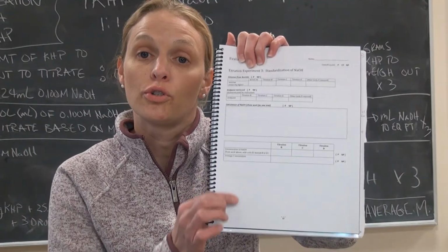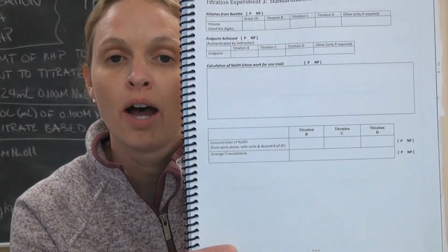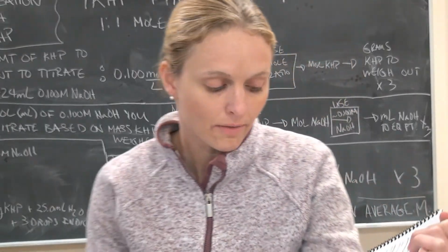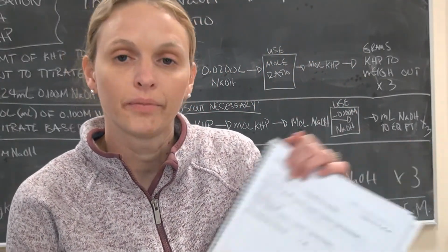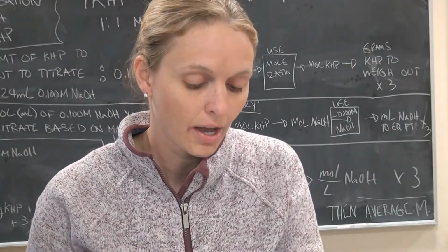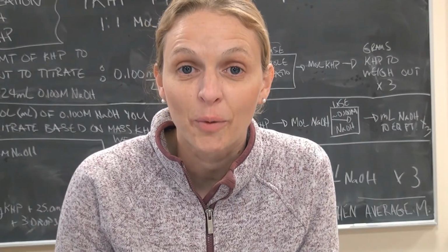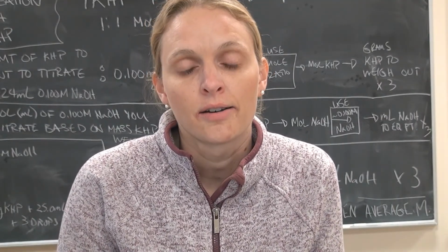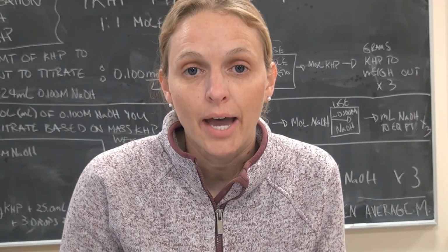I do want you to show at the bottom down here the calculations for number 1 and 2 that we talked about previously there. Okay, so you got that, and then you also have your results and discussion sheet to fill out for this lab if you need to do so. So please send me an email, you can call me if you have any questions about the lab.